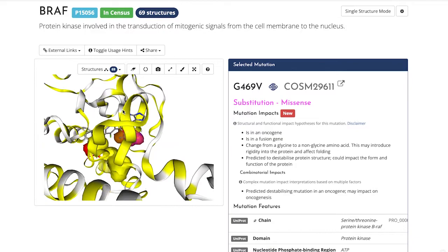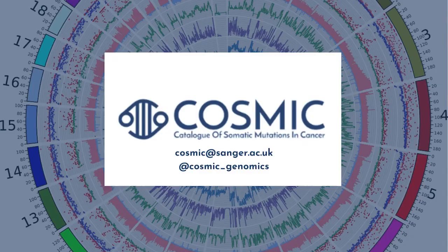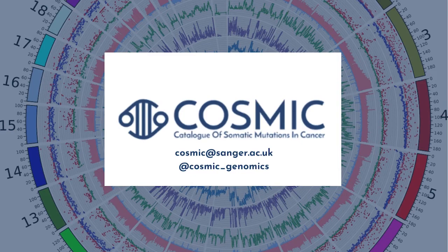And we have this for all of the missense mutations, in all of the different structures, for all of the genes in Cosmic 3D. A process that is being updated regularly.